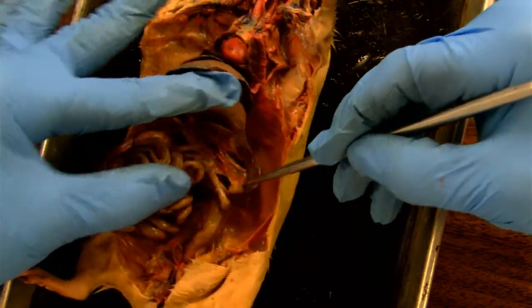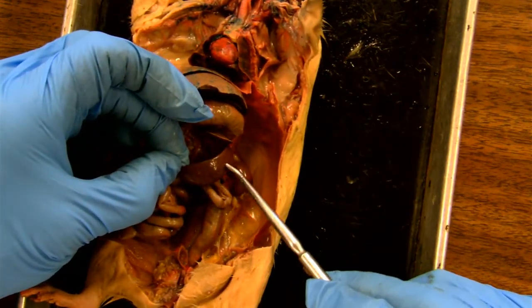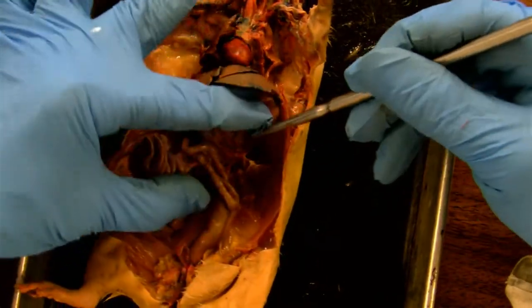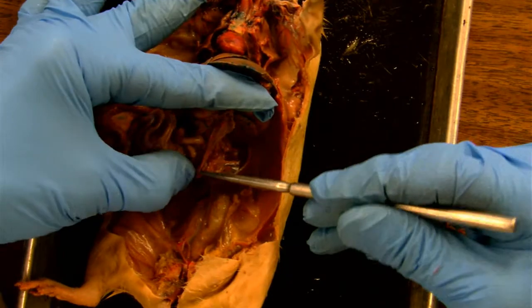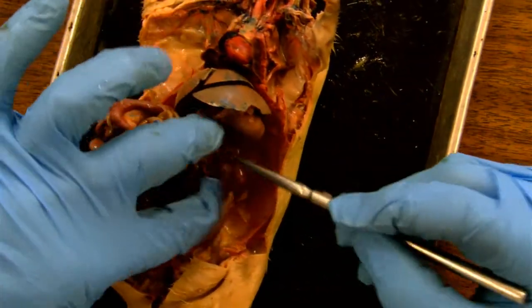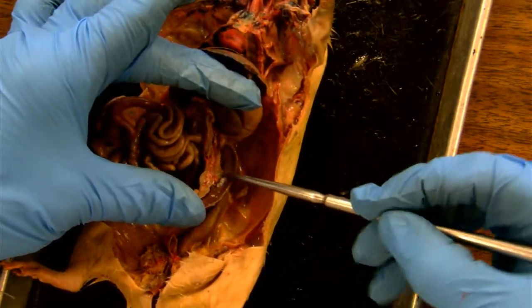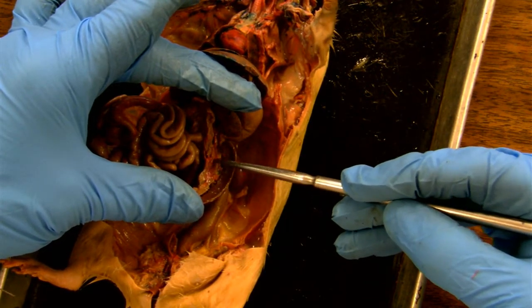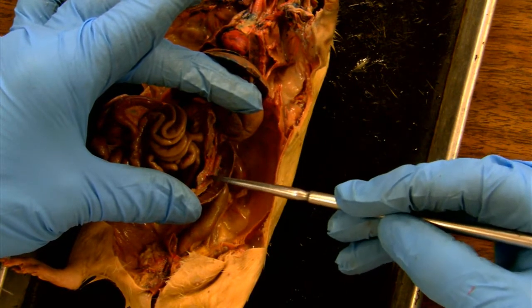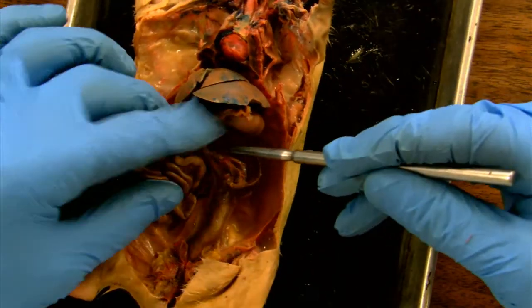The pancreas is not like the spleen — here's the spleen — it's not a big solid piece. It's sort of a grainy, distributed tissue that doesn't have a solid body to it, so it's usually in here. And I can see it spread around. Do you see this pinkish tissue that is attached to the membranes that tie the small intestine together? That was the pancreas.